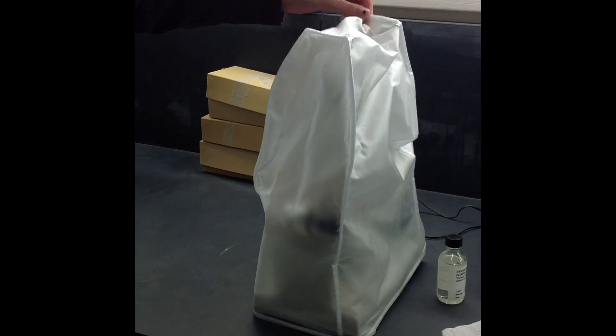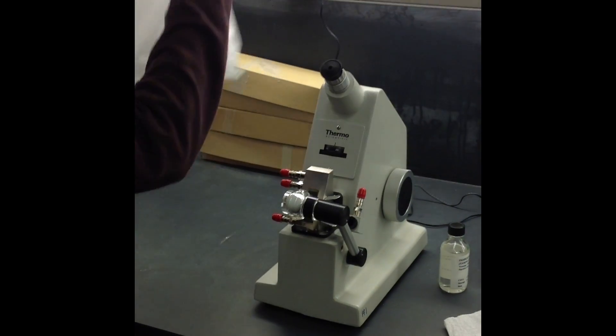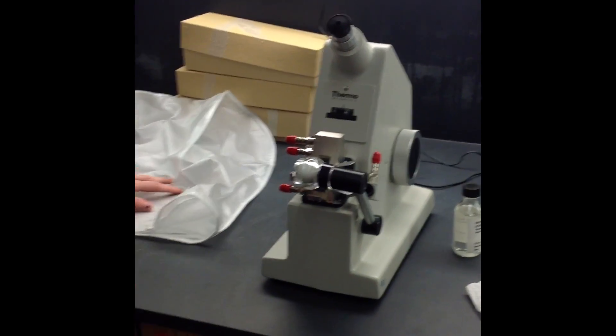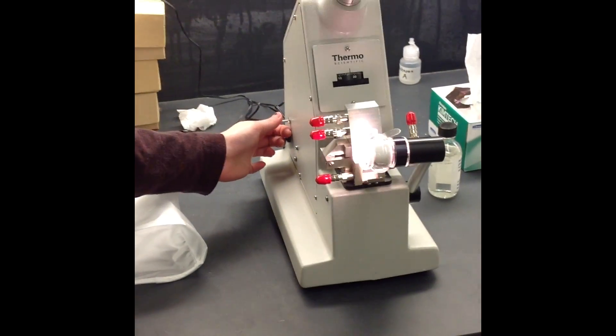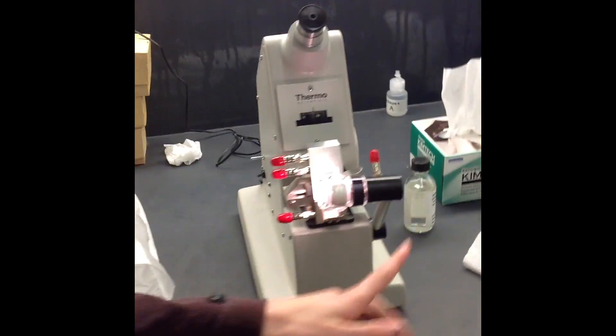First, I'm going to remove the dust cover and here's the refractometer. The first thing I'm going to do is turn it on by flipping the switch down here, and as you can see, this is your lamp.